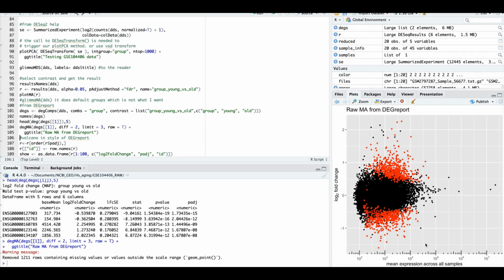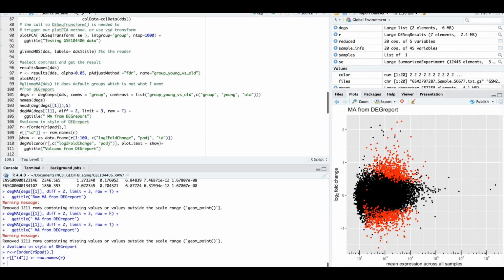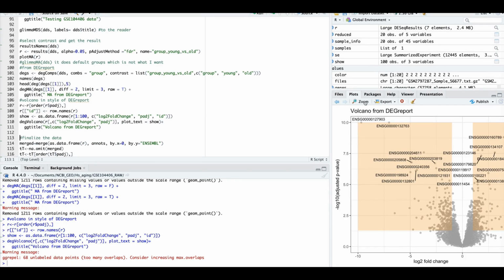Note that the scale is log. It has two options, shrunken and unshrunken, which you manipulate with the raw, false, and true. So my preference is true raw data, because if you do it false, then you have those blue stripes. And next to a visual distortion, I question whether shrinking step really helps to the data analysis. Oh, sorry, my ignorance.